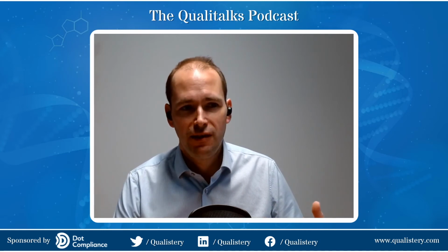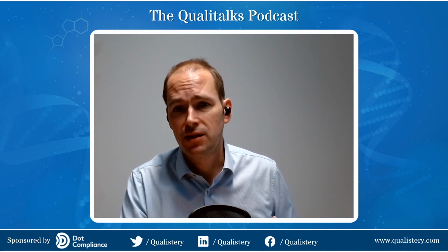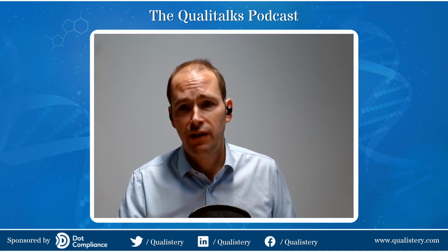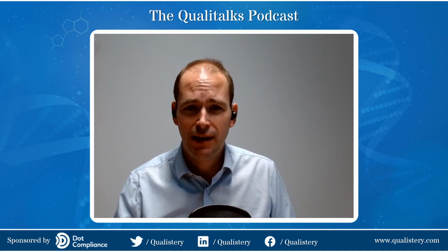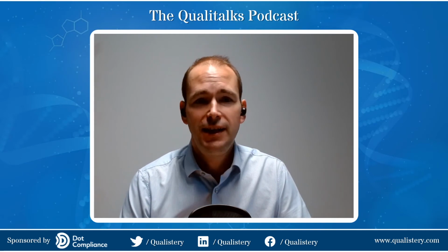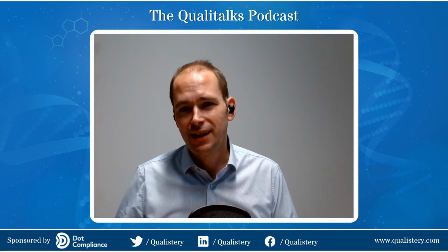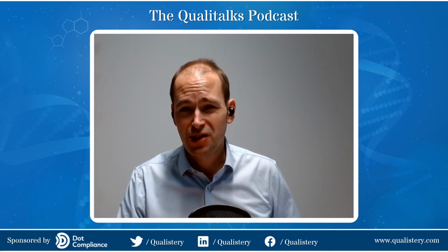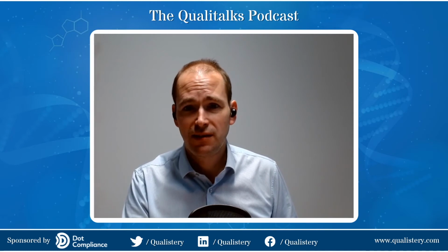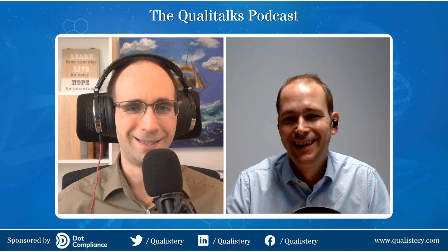So I think for me, it's important that the weekly tests are performed, that we're running leak rates, we're doing preventative maintenance on the machine, and that we've got regular validation that's looking into those load items and the complex areas, making sure that we haven't got any issues with air removal and that everywhere is being effectively sterilised. But on a basic level, I think people should be using biological indicators and temperature sensors and placing them correctly in the worst case load areas. Right. As a minimum, really.